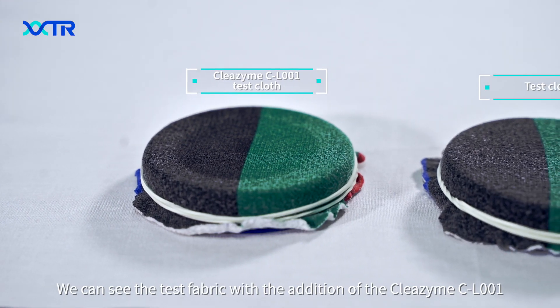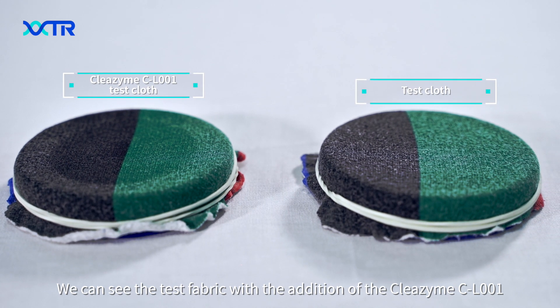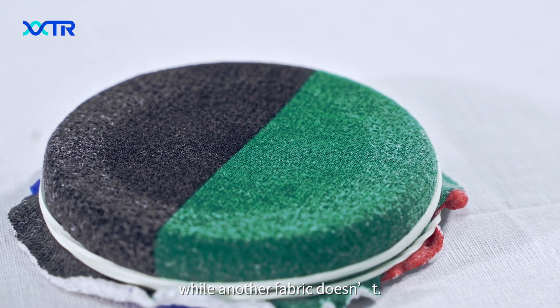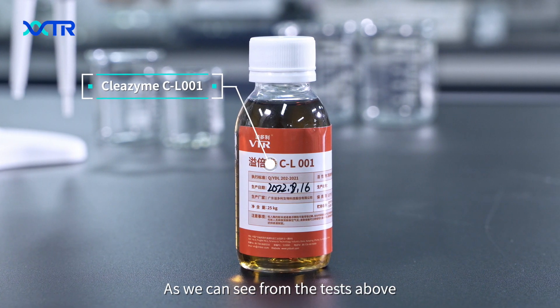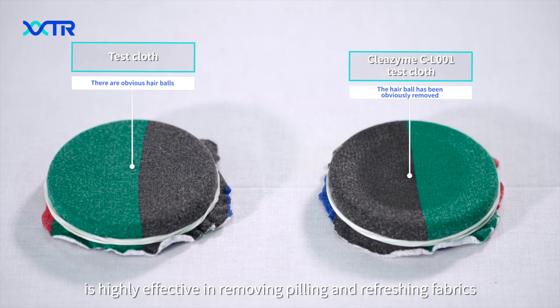We can see the test fabric with the addition of the Cl001 appears more vibrant and fresh, while the other fabric doesn't. As we can see from the test above, Cl001 is highly effective in removing peeling and refreshing fabrics. Thanks.